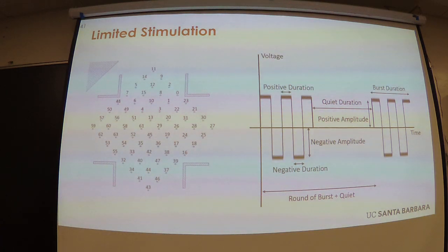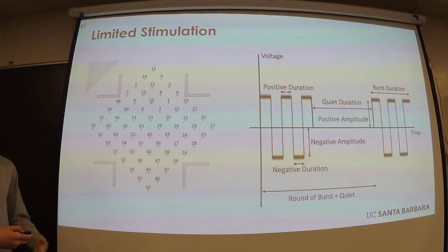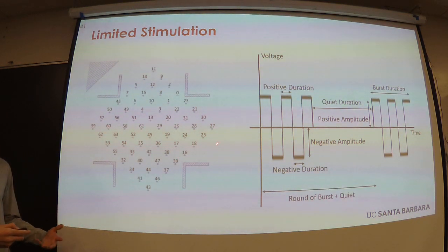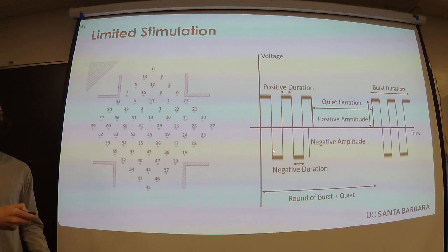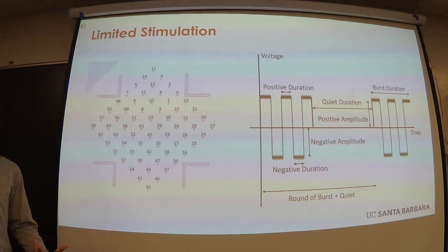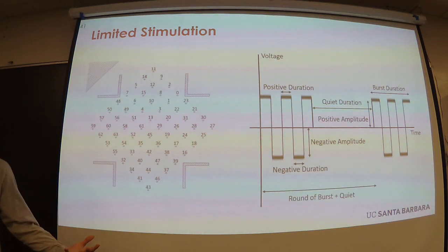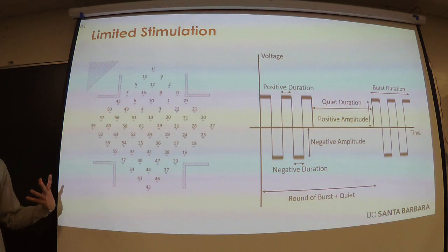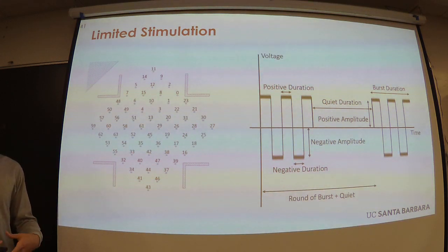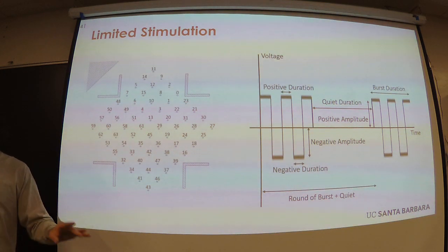Getting into the stimulation side, if we want to run meaningful experiments, we need to have a bunch of parameters that we have control over. One is selecting an arbitrary set of electrodes to run my experiment on. I also want hyperparameters on the waveforms we're sending in: the frequency, the amplitude, how long we're stimulating for, how long we're quiet, how many rounds of this we do. So I thought the best way to address this would be to build a system that would allow someone to put in all of these parameters, press go, and walk away.